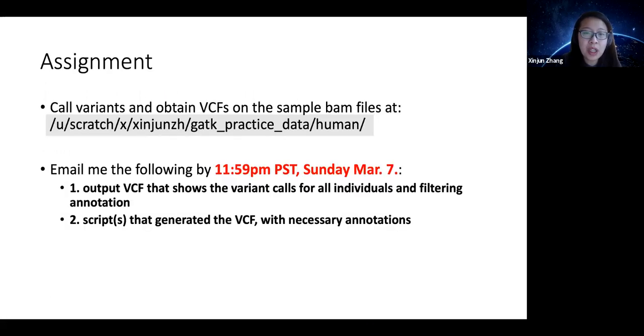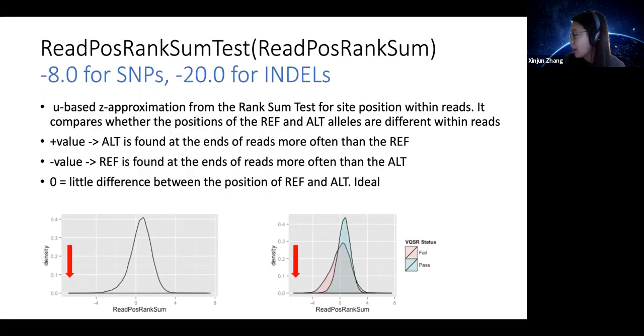For our practice data, if you're interested in the machine learning based method, I downloaded those sites already under the known sites folder. You can copy those to your directory and use VQSR, or alternatively, you can use hard filtering. This step may be faster than before.